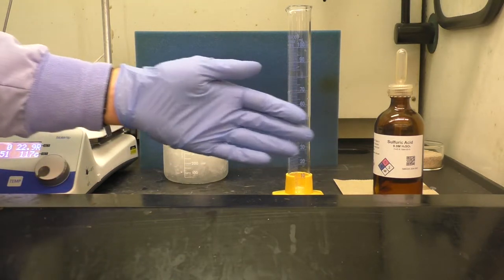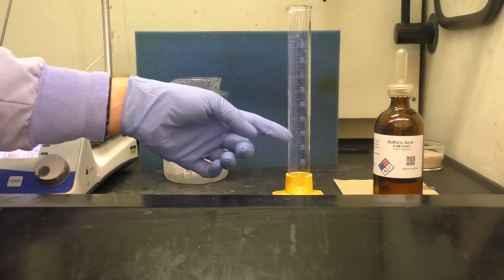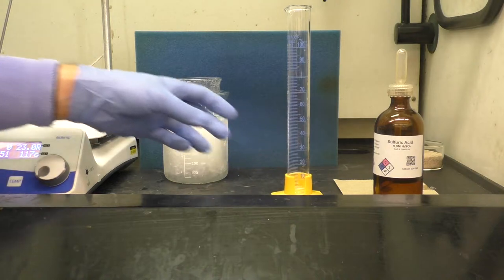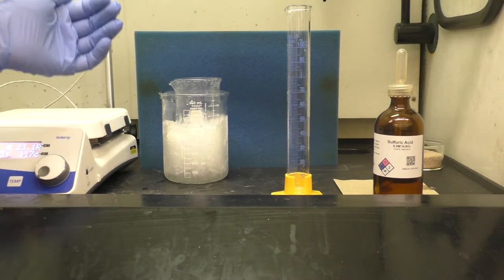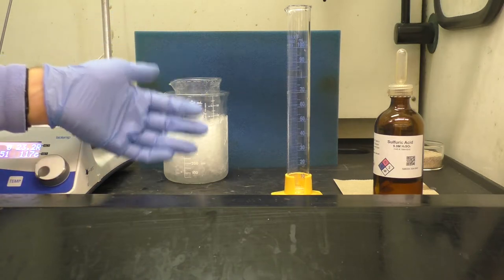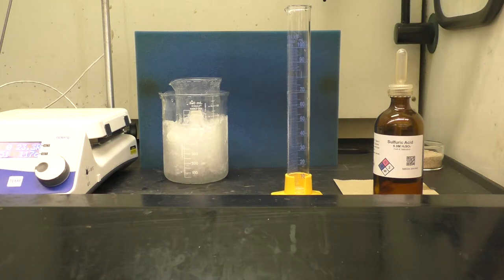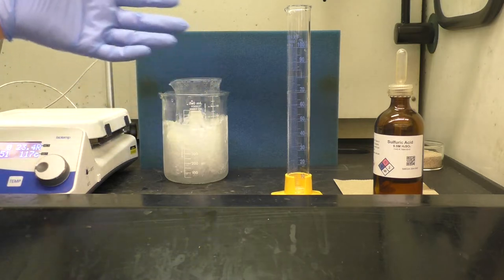Essentially, what we're doing with this is simply neutralizing the solution. So after we have added the sulfuric acid into the reaction mixture, and we'll want to do this very, very slowly and carefully in the ice bath. You're essentially adding a strong acid to a strong base and expect there to be a lot of heat evolved from that reaction. So we want to do that carefully in the ice bath. And then after we're done, we'll test the pH of the solution just with some litmus paper, just to tell us if we have in fact neutralized the solution or made it acidic.